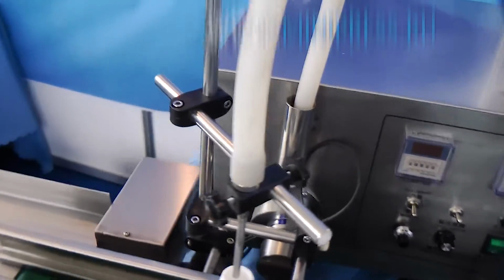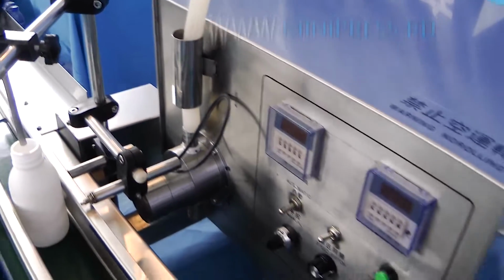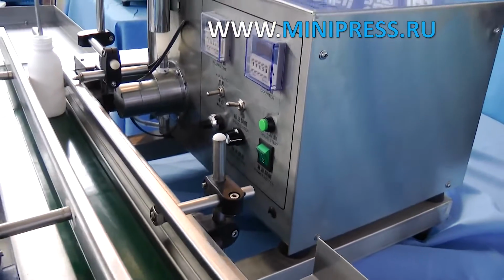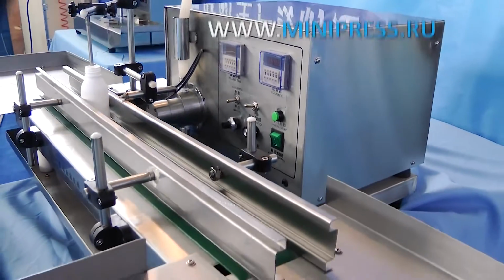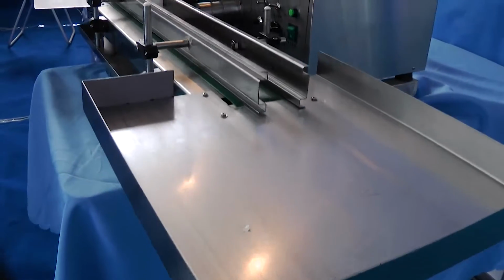I made the choice of new equipment independently, coordinating it with the management before purchase. It was not an easy job. There is a lot of equipment on the market. Many processes have changed and become automated. In pharmaceutical production, it is very important to control the quality of raw materials and finished drugs.